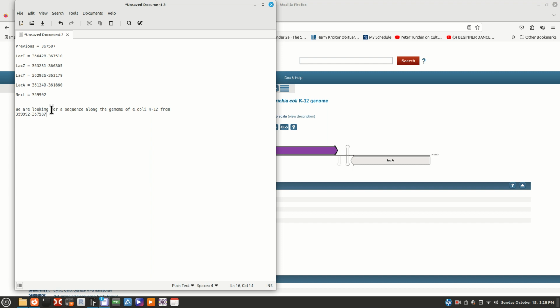And this would find supposedly the sequence that I already have. Like I said, the lac operon is well studied, so this sequence between these two is pretty much already well used, so it's already in the database. People have just said, oh, people are going to want this.